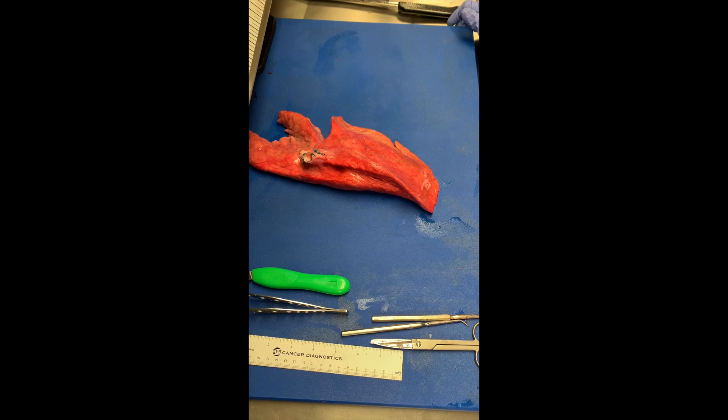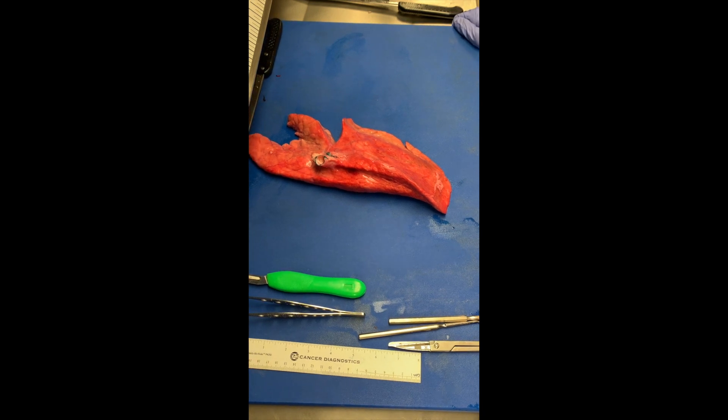The first thing you should do after orienting yourself to the right versus the left lung with a total pneumonectomy is weigh the specimen. The next step is to measure the specimen in three dimensions. After you do that, you can ink your hilar structures, and remember you can ink your hilar structures the same color because they look different under the microscope.